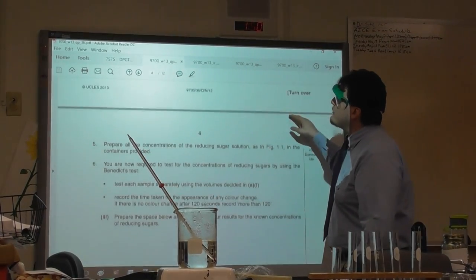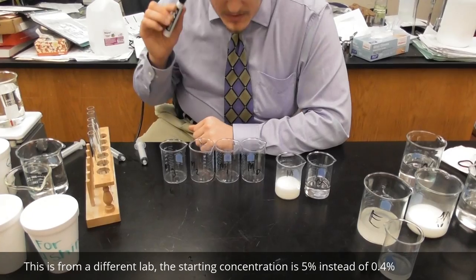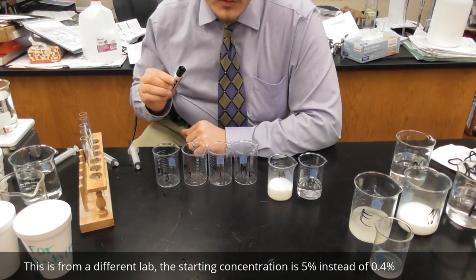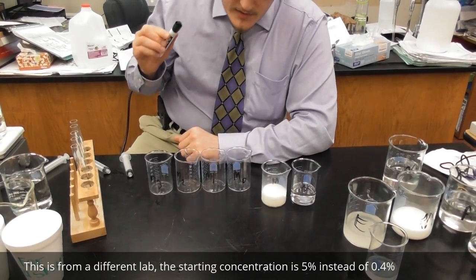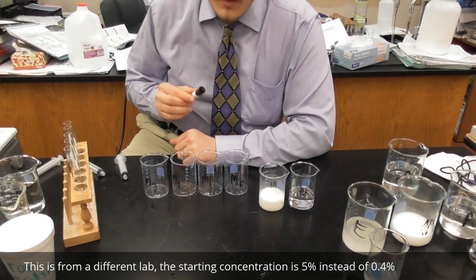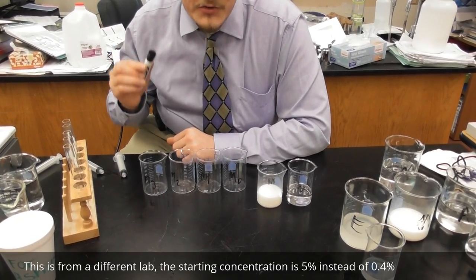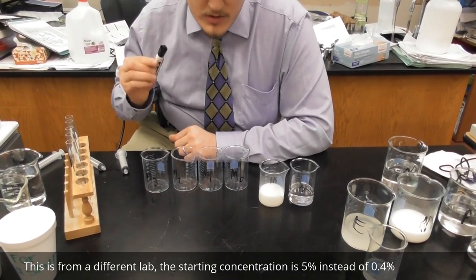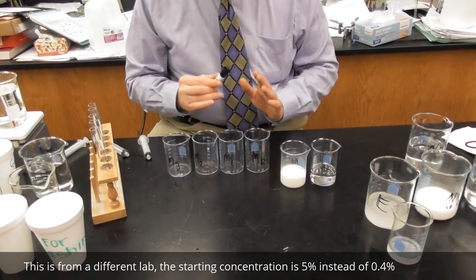Now I can draw that on a figure at a later time. Right now I feel like I'm on a roll. But I figured I'd take this moment and this opportunity to show you serial dilution as well. And this is another Cambridge skill that is extraordinarily important and something that you absolutely must know on a very short time scale.